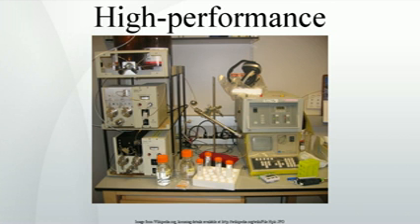High-performance liquid chromatography is a technique in analytic chemistry used to separate the components in a mixture, to identify each component, and to quantify each component. It relies on pumps to pass a pressurized liquid solvent containing the sample mixture through a column filled with a solid adsorbent material. Each component in the sample interacts slightly differently with the adsorbent material, causing different flow rates for the different components and leading to the separation of the components as they flow out the column.